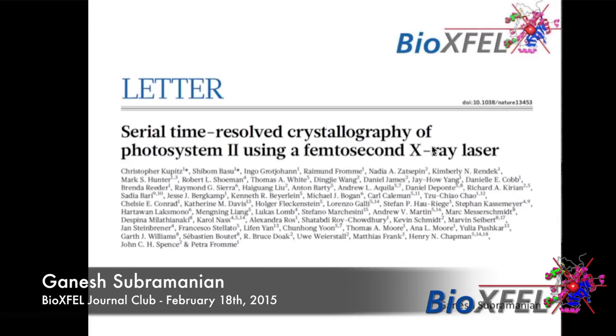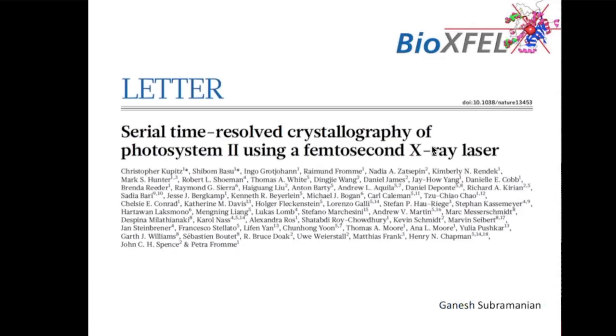So this will be on the work that was published last year and done probably a couple of years back. It's on time-resolved crystallography on photosystems using X-ray laser. So I'll try to make this talk, as much as possible, not redundant with information that we gave, and try to make it more specific to photosystems. But if there is at all any redundancy, please bear with me.